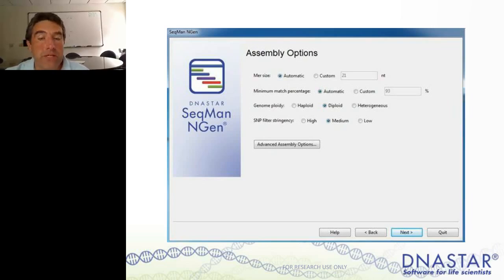However, with the validation control, you can change these parameters and then get a statistical measure across a very large data set to learn, did you become more or less accurate for all the data points in that project. So the validation really allows us to make some changes from the defaults to see if we got more or less accurate with the particular data set that we're working with. It's a great way to fine tune and optimize by using one of these validated controls.